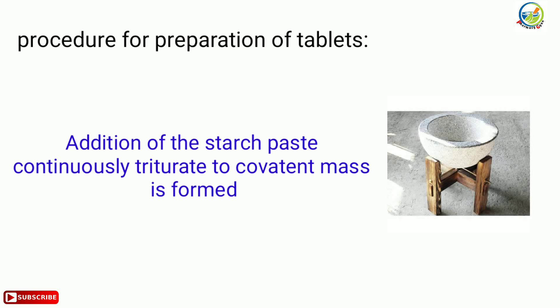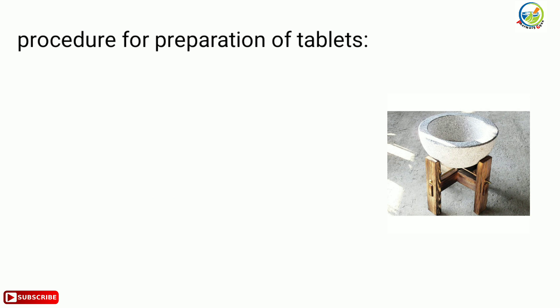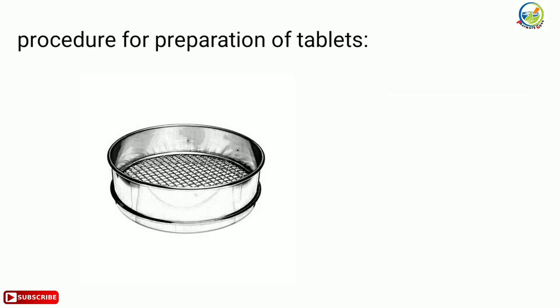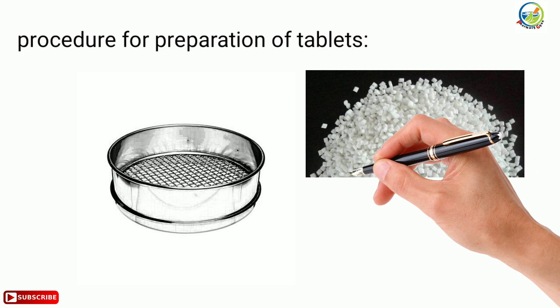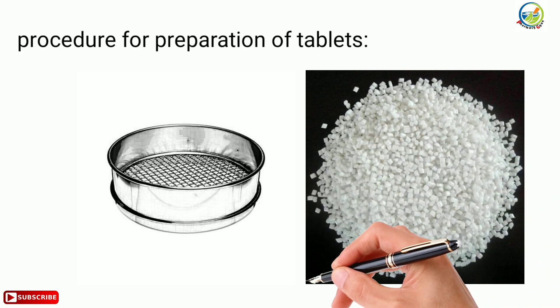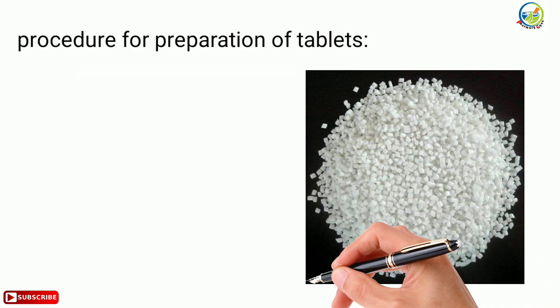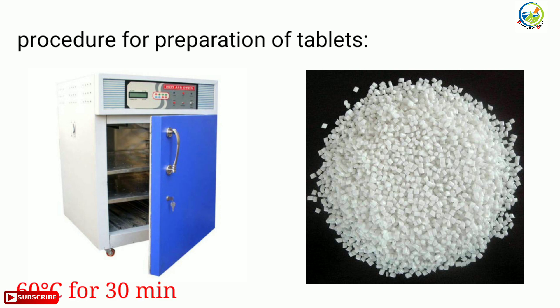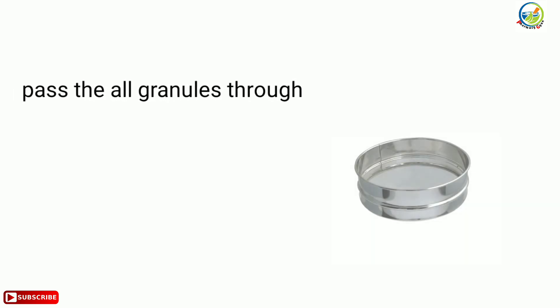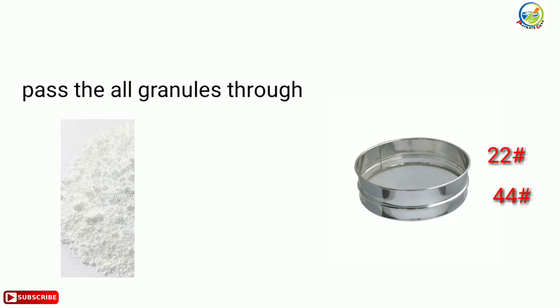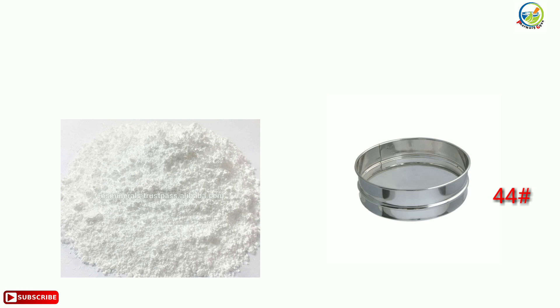Pass the cohesive mass through sieve number 10 and collect the granules in a tray. Place the tray for drying in a hot air oven at 60 degrees Celsius for 30 minutes. Pass all dry granules through sieve number 22, with sieve number 44 placed below. The granules retained on sieve number 44 are the desired granules.